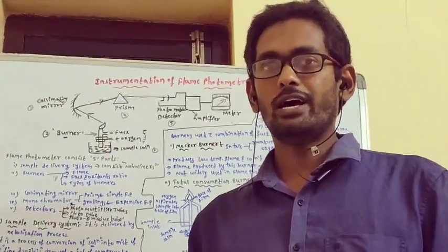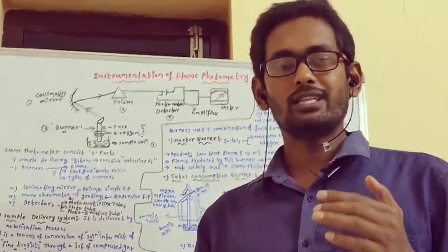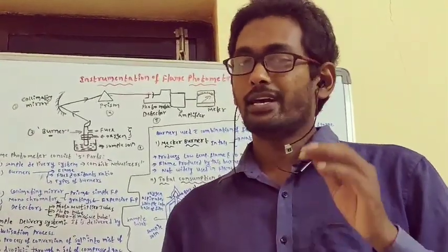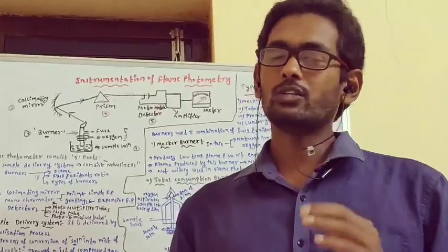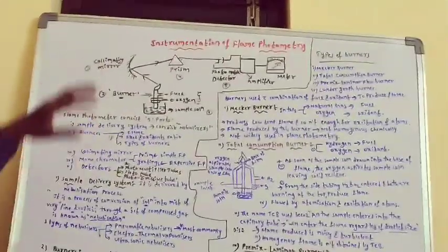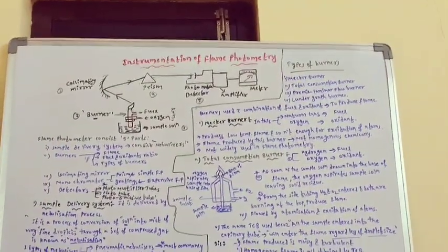In my last video, I explained the principle and theory of flame photometry. In this class, I am going to explain the instrumentation of flame photometer. Here you can see the block diagram of a flame photometer.